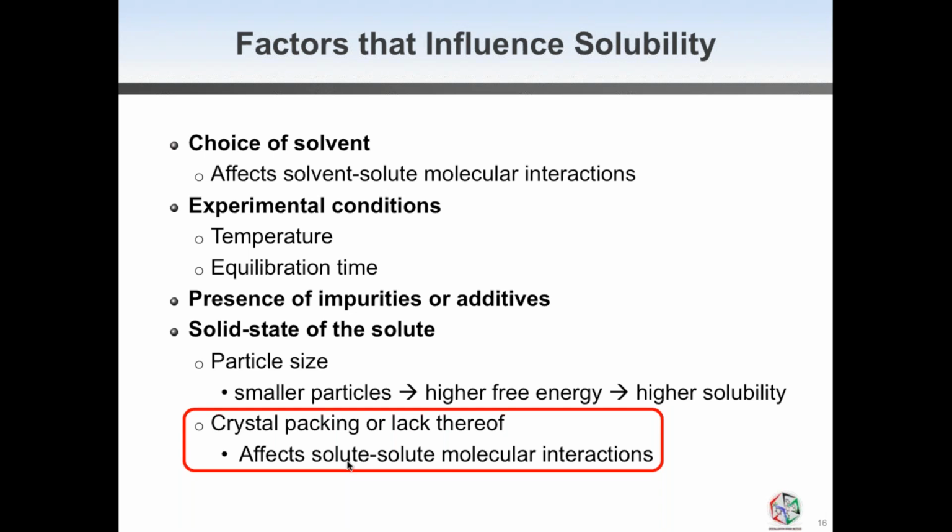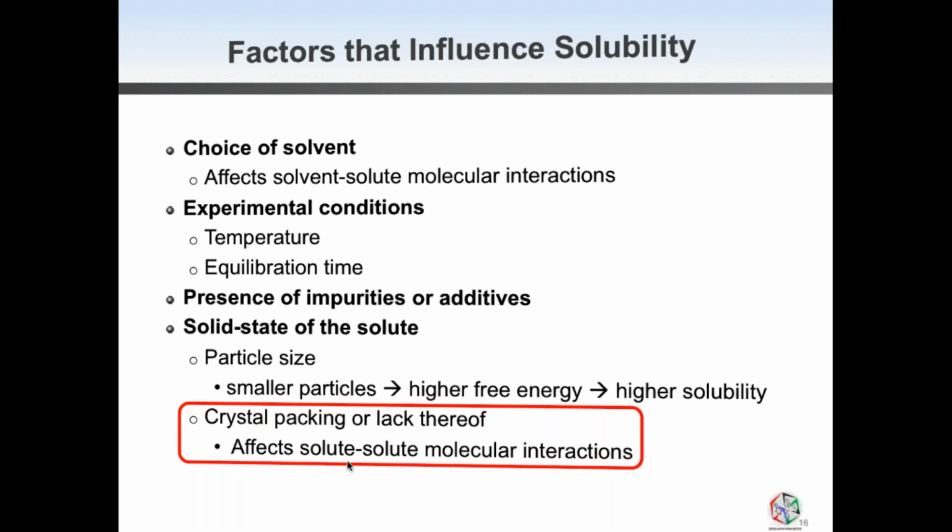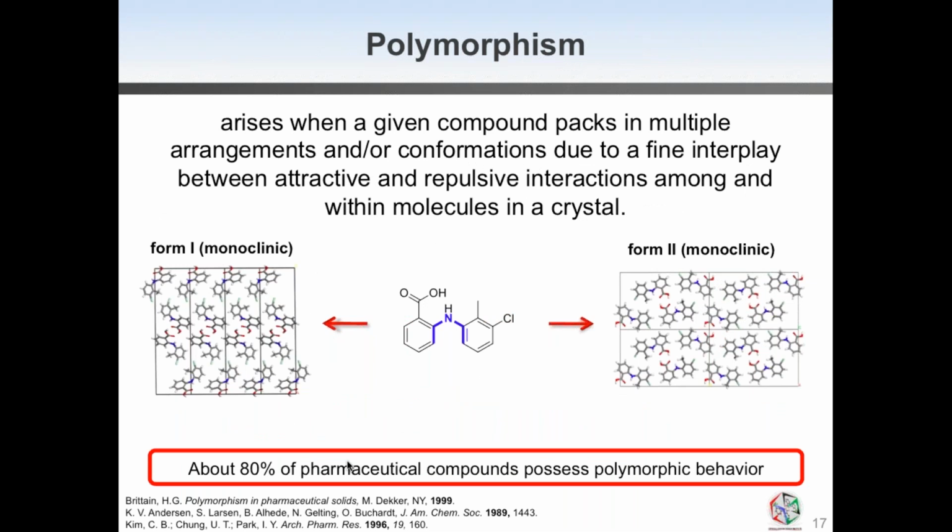Thank you, Thorsten. In the realm of crystal packing, polymorphism is a phenomenon that allows molecules to pack in different arrangements and/or conformations within a crystal lattice. Here, as an example, are two of the most stable polymorphs of the non-steroidal anti-inflammatory drug tolfenamic acid.